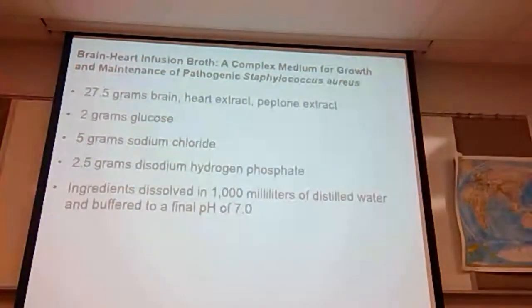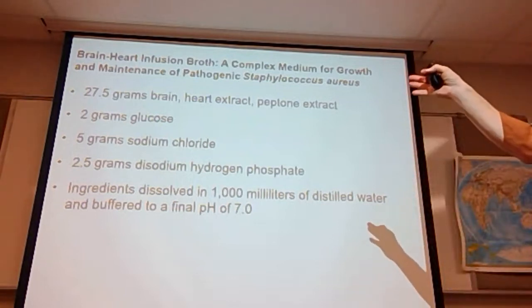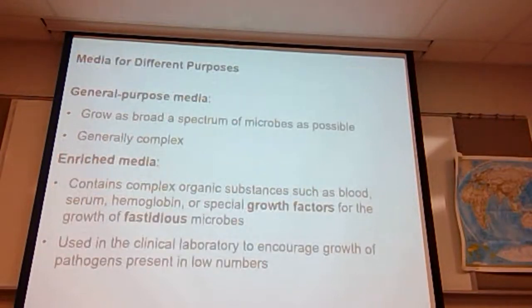Brain heart infusion, another item that you can use for growing Staph aureus. Again, not going to ask you to remember all of these numbers and grams and things. Just another example of a complex medium made for growing a very particular type of Staph aureus.